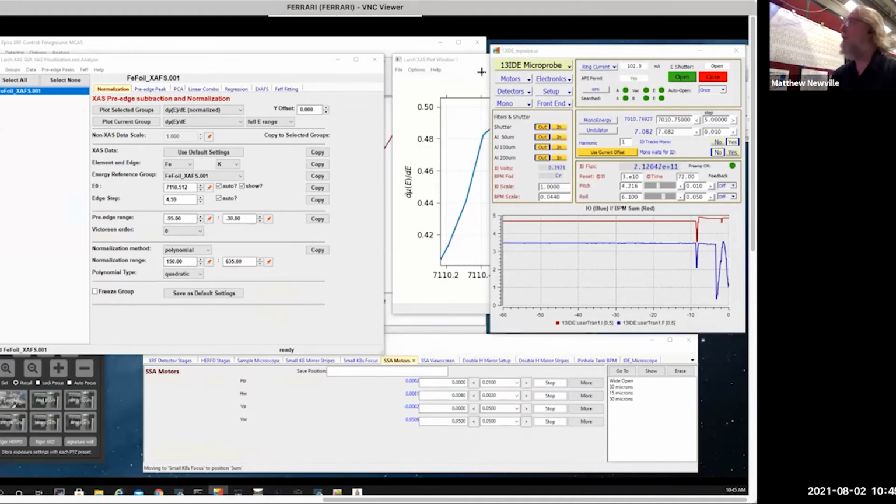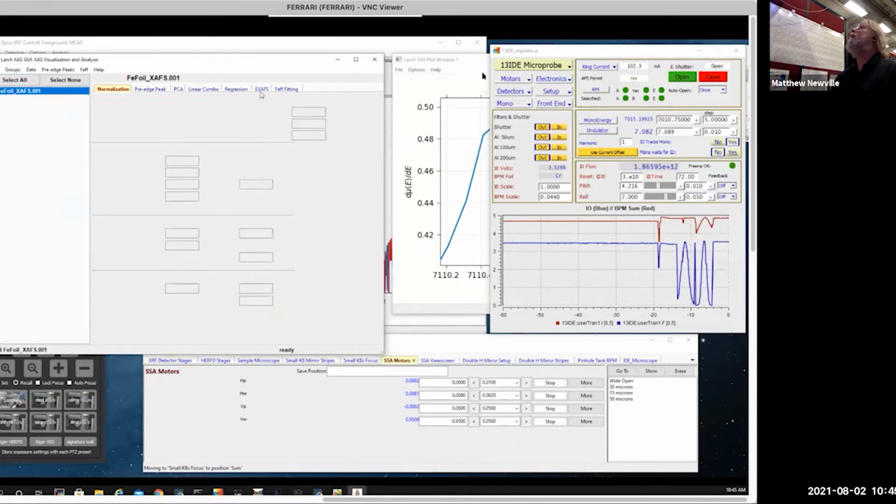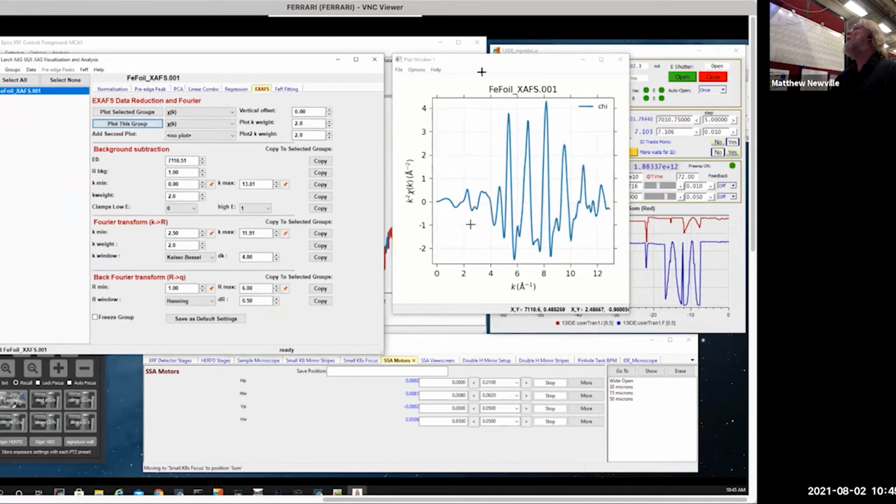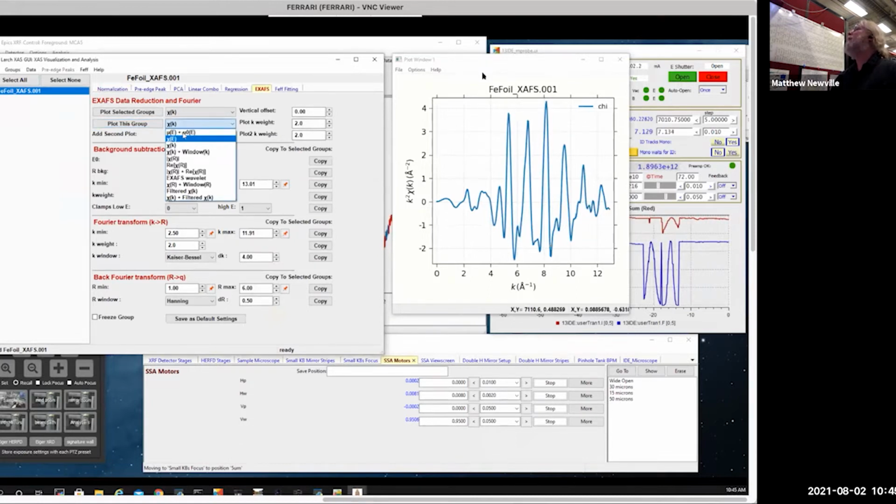When this goes, it does a little dance at the beginning of each scan. While it's taking that scan, I'll just go to this data set, which isn't bad. I just want to fix the energy definition. I'll just go to the XAFS and see what the XAFS put out. So that's the XAFS for this. That's okay. I just guessed at a background. There's the background. It's not too bad.